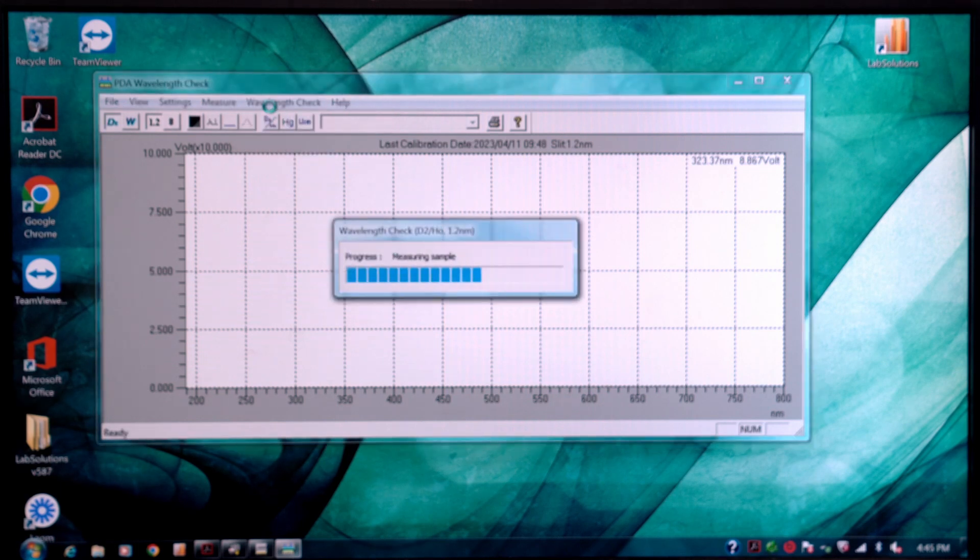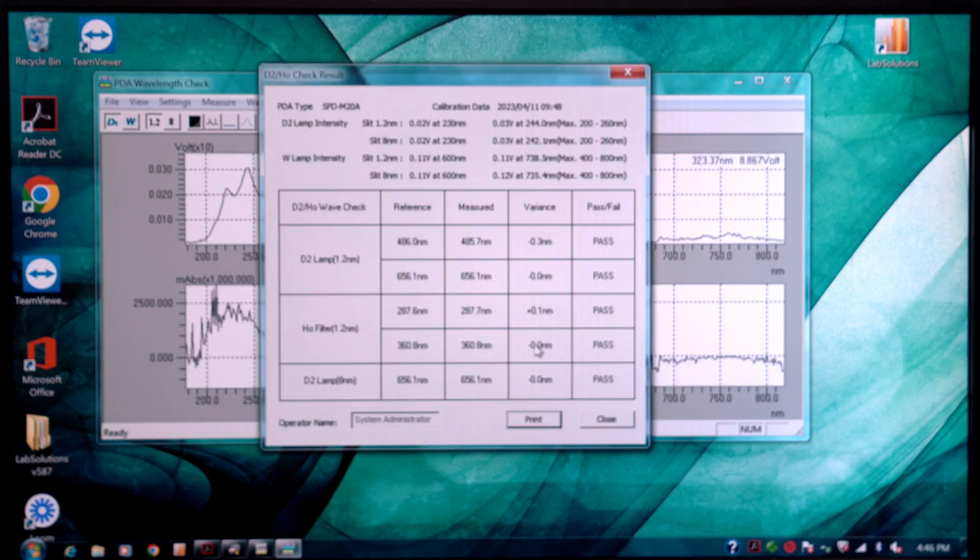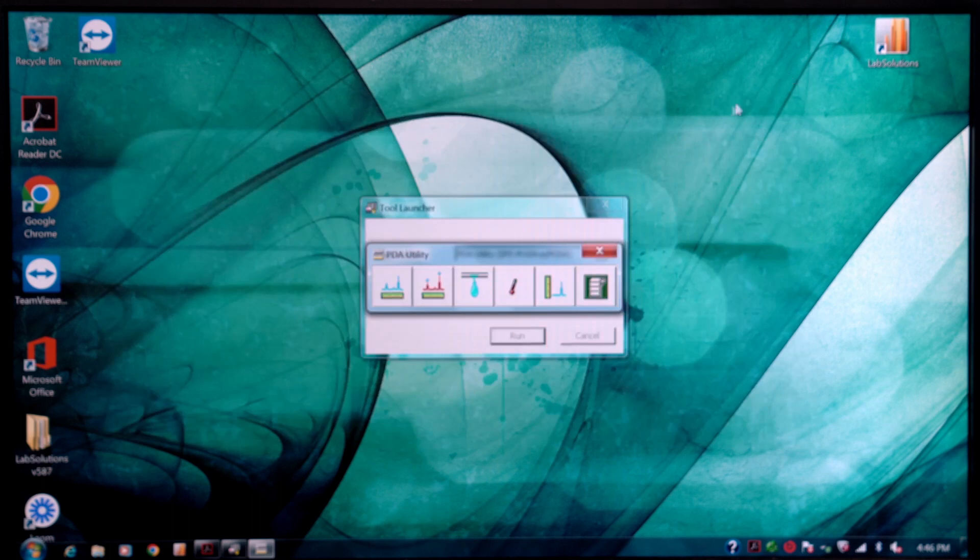If this fails, you either have forgotten to put water in the flow cell, you have bubbles, or maybe you should change the lamp, which is what we're doing. So look, everything passed. If this fails, the next thing you want to do is go here to wavelength calibration.